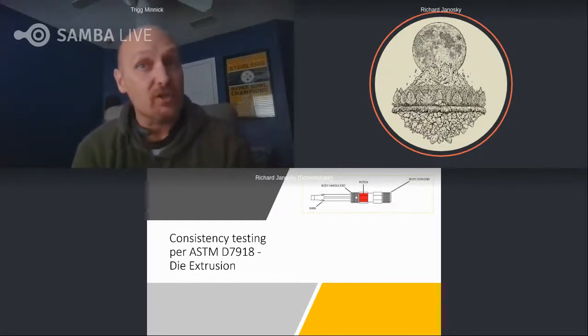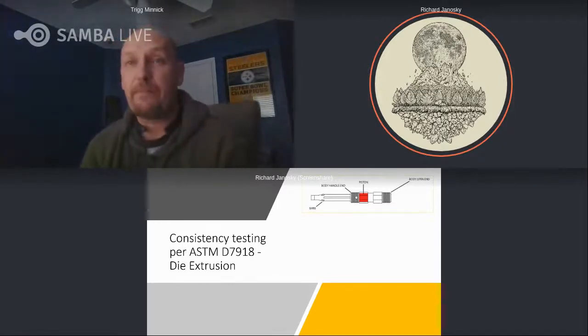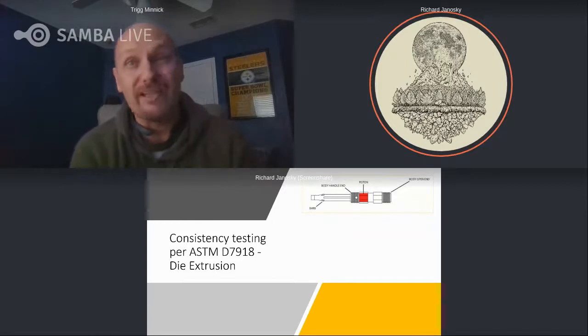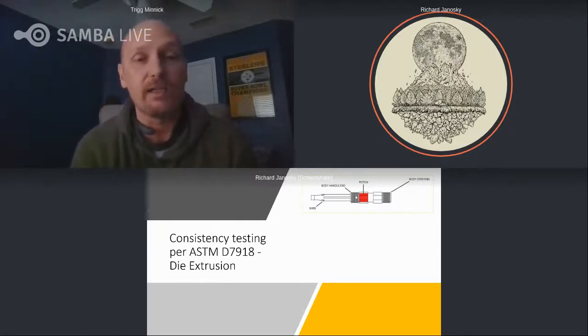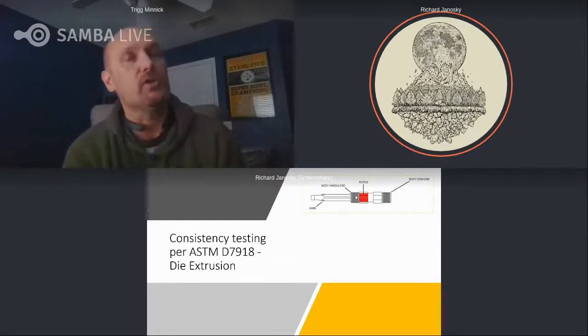You will get a demonstration of how we get what we call a GTI reading. He'll talk about what that means in regards to grease consistency and how this is a valuable method for used and new greases. And he'll even hit on some of the ASTM standards around this.